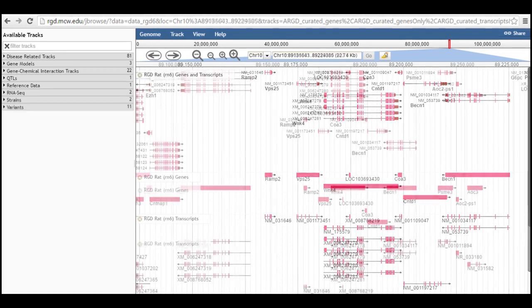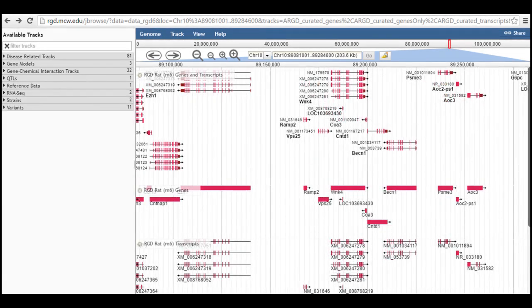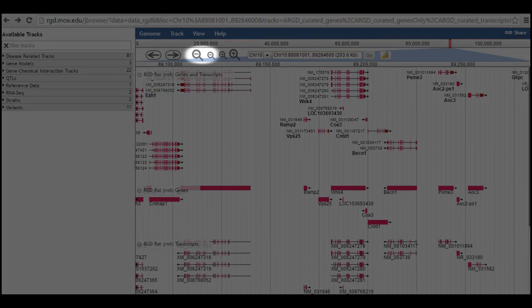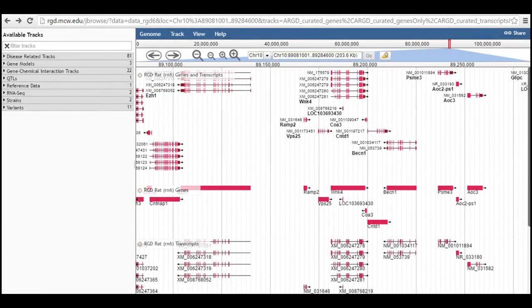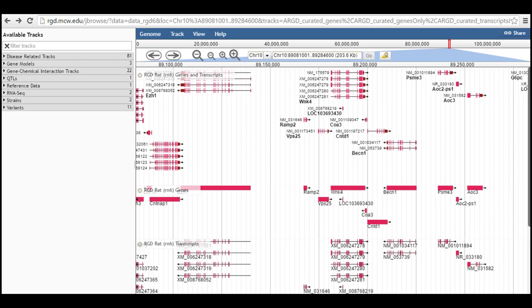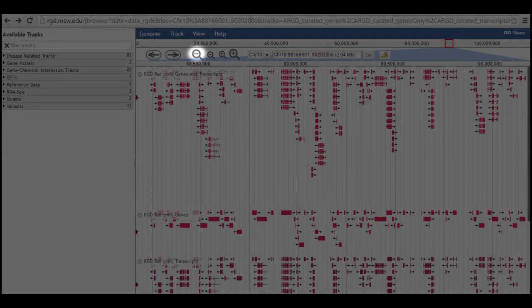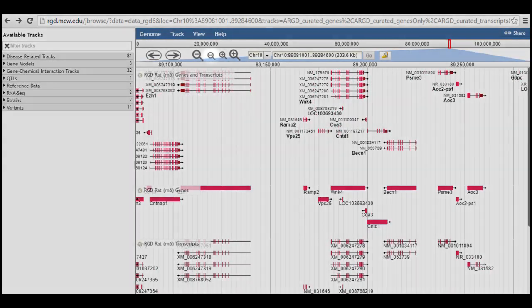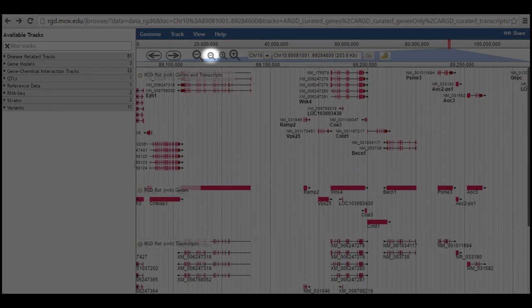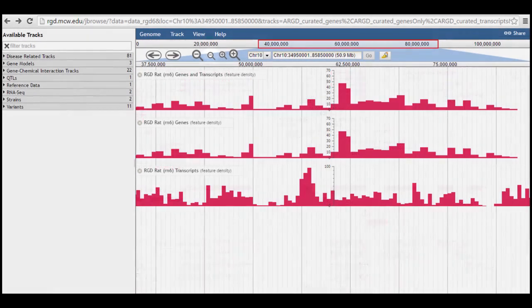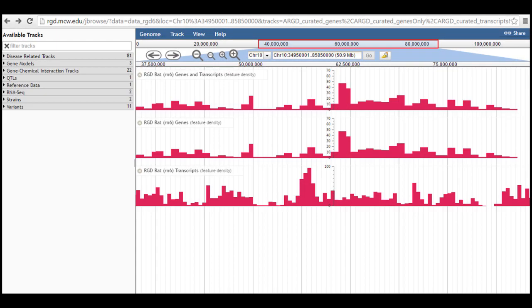Zooming out can be accomplished using the minus magnifying glass icons or clicking and dragging on a larger region of the full chromosome number bar. As you would expect, the amount of zoom that results is larger for the larger icon and smaller for the smaller icon. Notice that when you are zoomed out far enough, the genes tracks change from showing individual genes and or transcripts to a feature density histogram display indicating the number of genes in each reason along the chromosome.